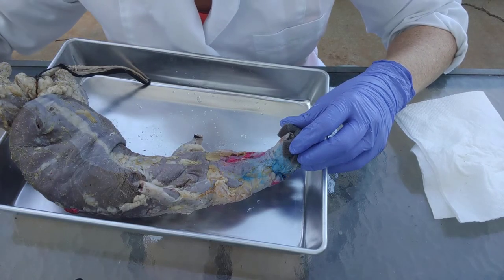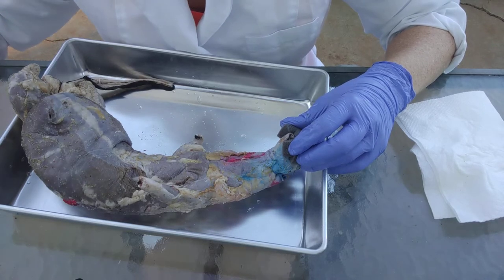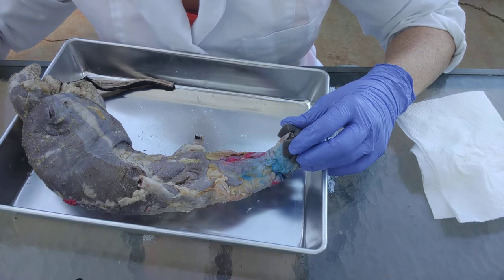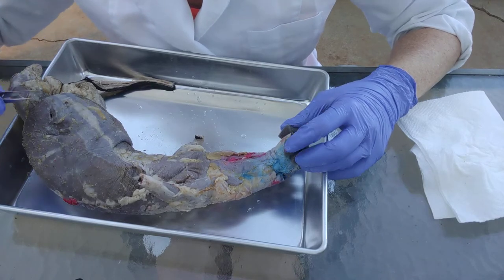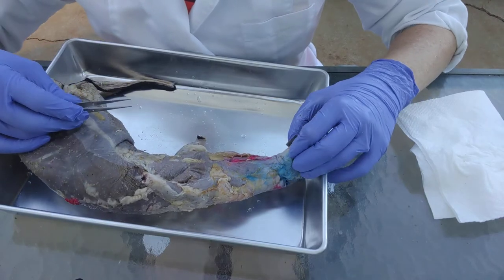Today we're going to talk about how to dissect the muscles. I am not going to be going over any particular muscles — for that you should check out my online resources muscle page. For this one we're just going to talk about some generic strategies for how to get these muscles dissected.